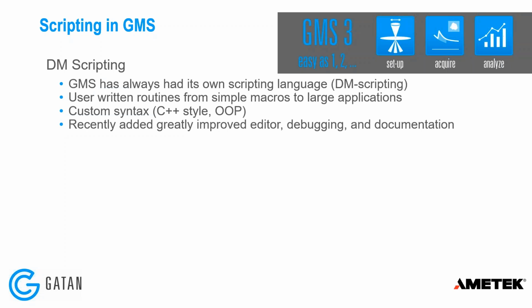And even just recently, we've added an improved editor for scripts, and also additional debugging tools, and a lot more documentation. So if you've done DM scripting in the past, but it's been a while, or you haven't checked out the help in GMS for a while, there really is a lot of new stuff for DM scripting within GMS.